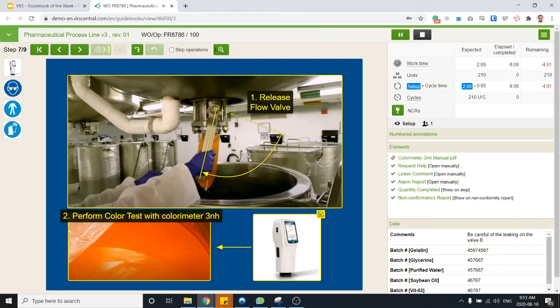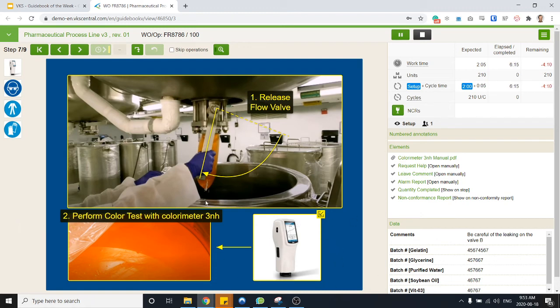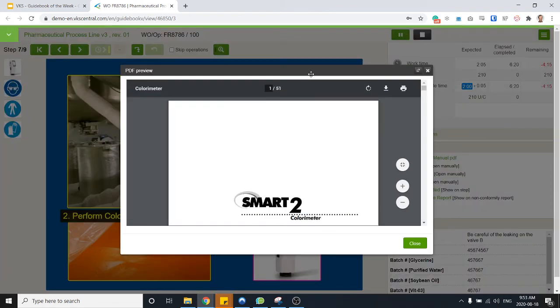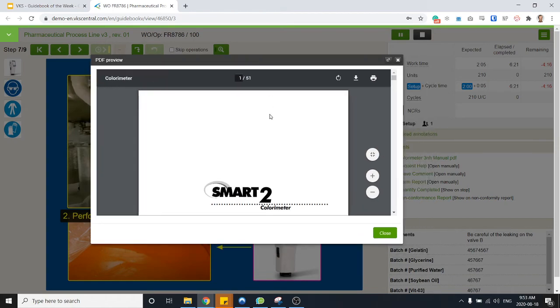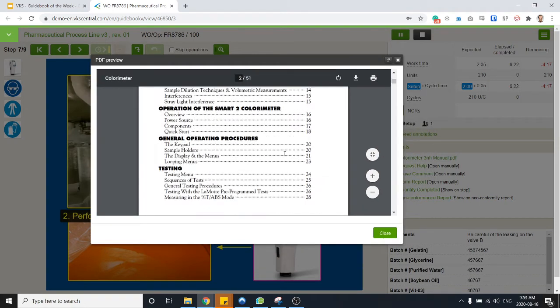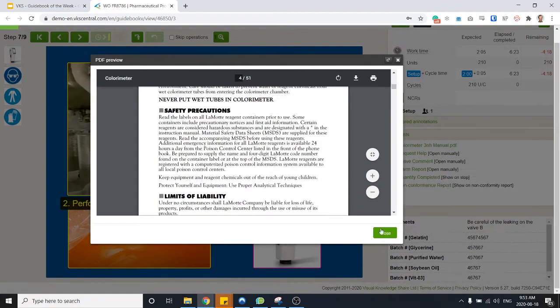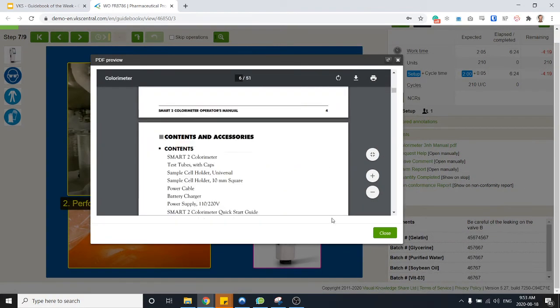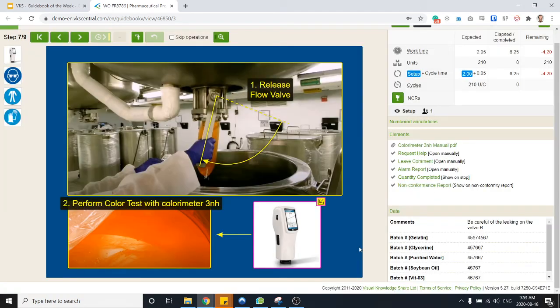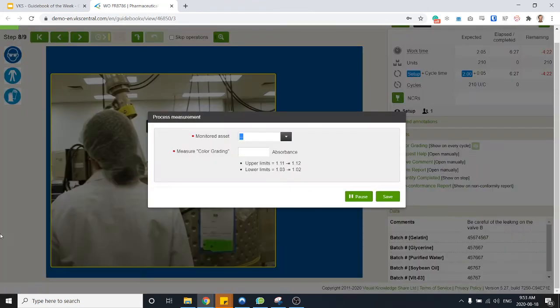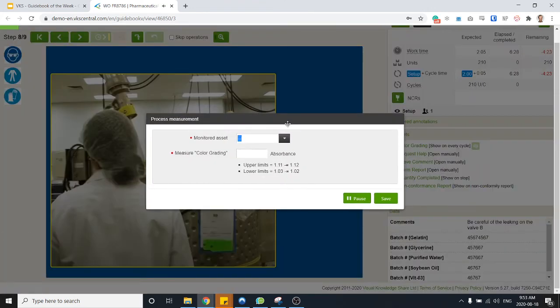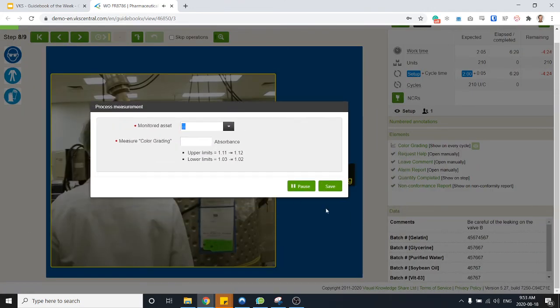Release the flow valve, perform color test. So here we've got something new that we haven't seen before in the other videos, which is a control chart. So here I need to perform a certain test, and I mean again I have a link that will show me how to use this particular tool if I don't know how to use it. But then when I move on to the next step I do have my control chart opening up on screen.